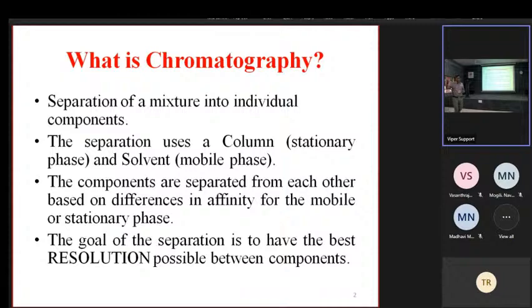Have you studied chromatography? Chromatography was actually an accidental discovery. The very first was the paper chromatographic technique. It was an accidental discovery. Now it has evolved to LCMS and GCMS, the most advanced techniques.